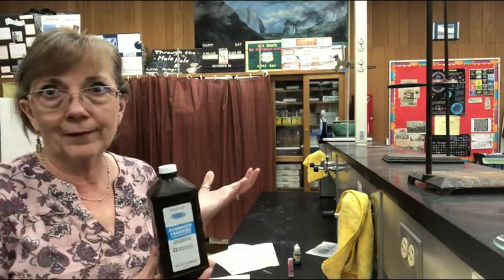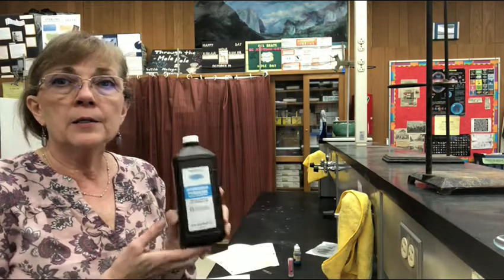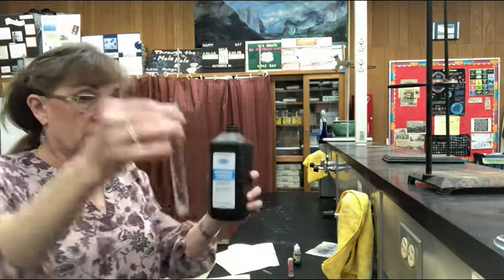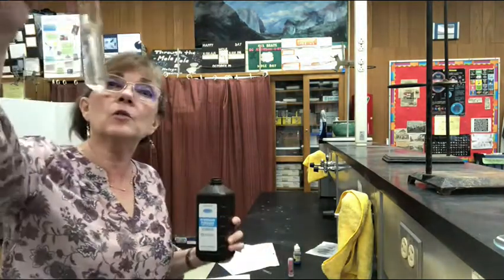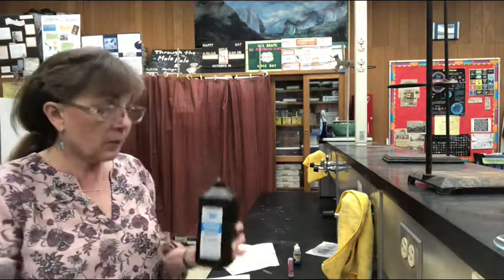decomposes, there I just gave you the type of reaction, into water and oxygen. And we can speed that up if we make use of a catalyst. So I'm going to pour some of the hydrogen peroxide into a test tube. Don't need a lot, that's probably too much. You can see it looks just like water. This is only 3% hydrogen peroxide.